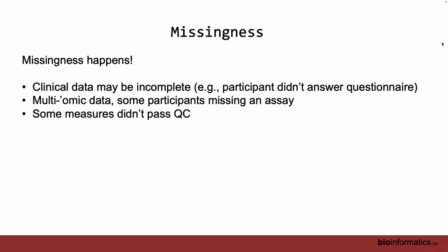Then you have to make sure that you don't have an unusual dropout in the number of genes because you under sequenced a sample. Control for sequencing variation. There's a variety of situations in which you generate and analyze data. These are just general principles, and you have to see which one fits in your situation.